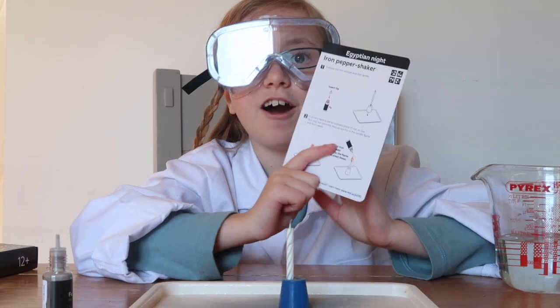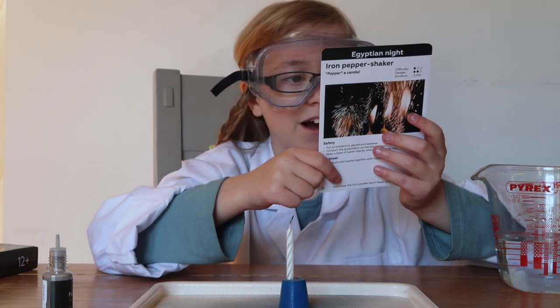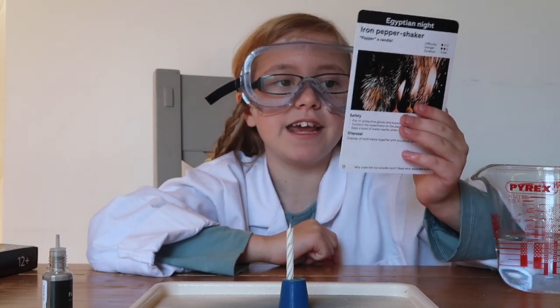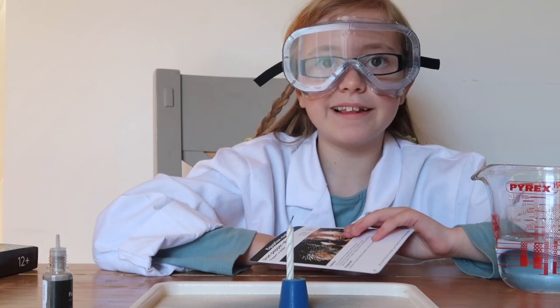It says on the card here a really interesting fact: it's very hard to set an ordinary piece of iron on fire, but tiny, tiny iron particles heat up quickly in the candle flame and burn easily. Isn't that cool?